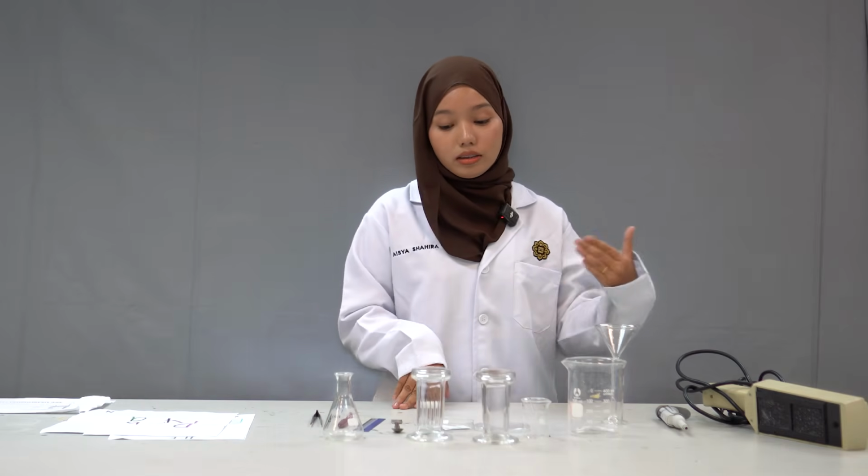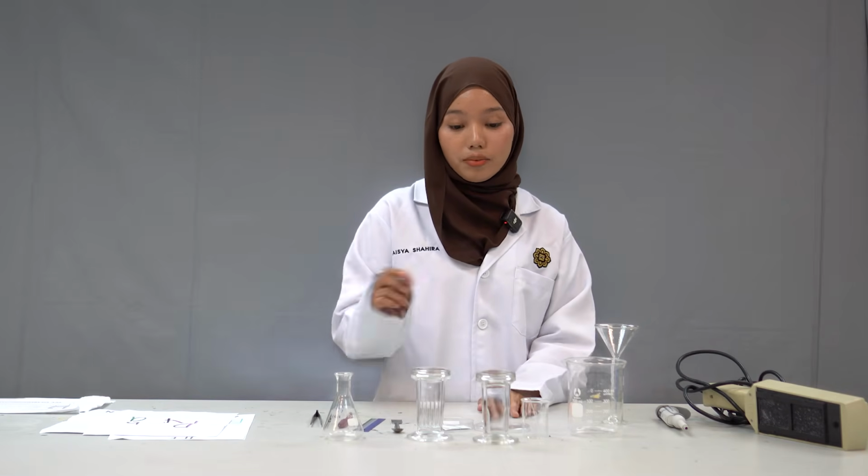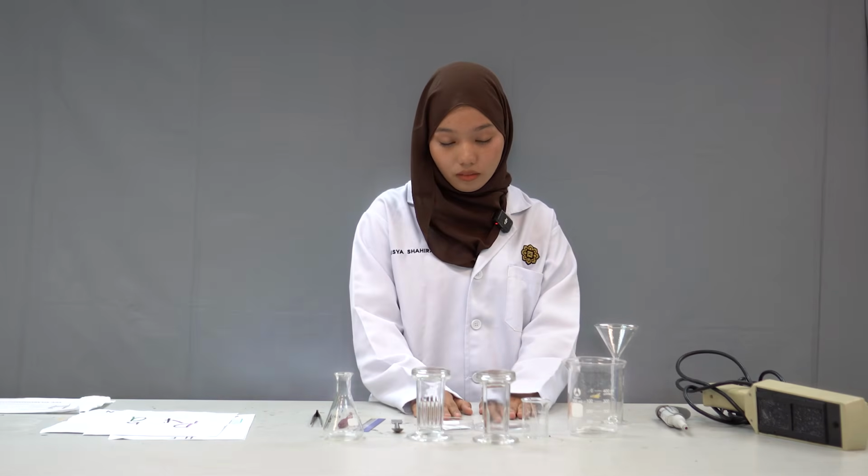And lastly, when we prepare the TLC plate, we use a pencil rather than a pen. This is because the pen contains dyes and organic solvent that can dissolve or spread when the TLC plate is placed in the developing solvent.